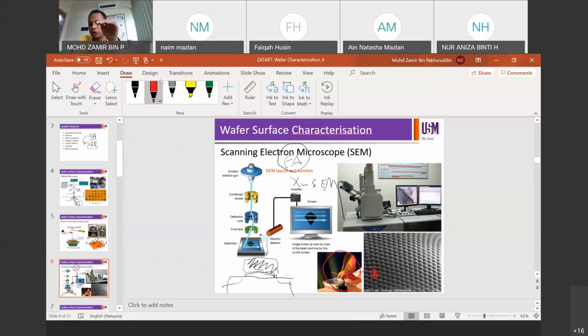If you look at the scale there, that is a SEM image, by the way. It's captured from an angle, I think somewhere 30 to 45 degrees from the surface. So it looks like that. If you look at the scale in the SEM, that's about 100 micron. So this is just one example.